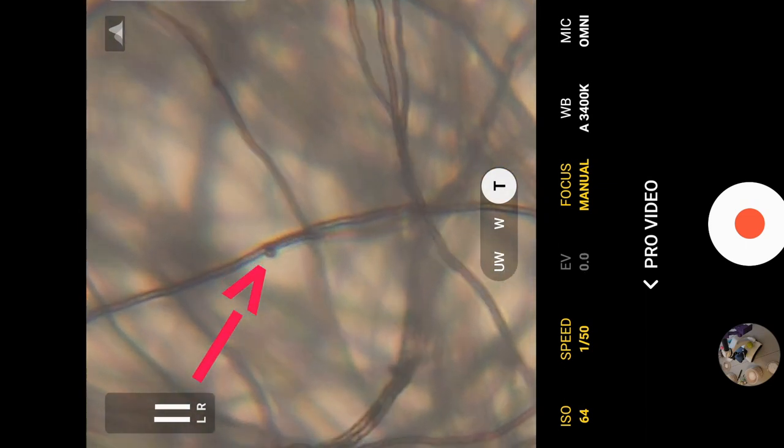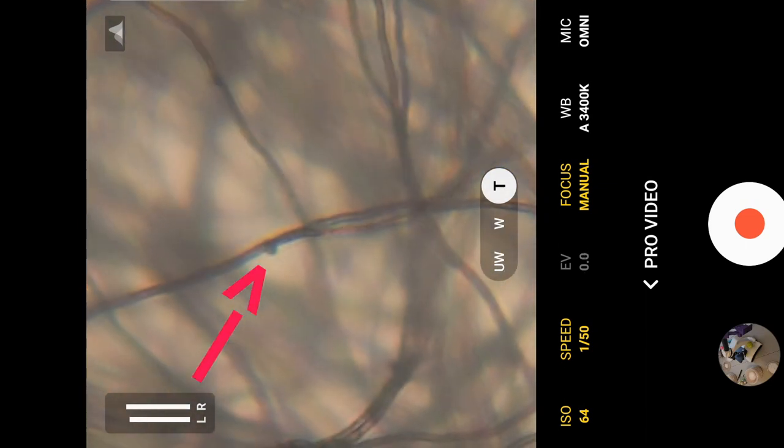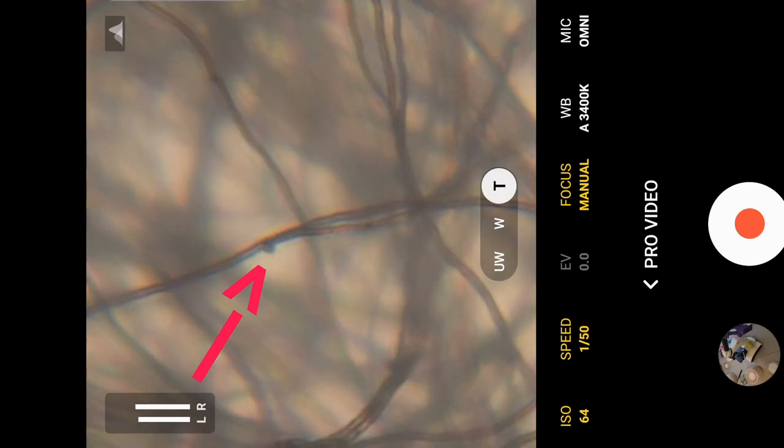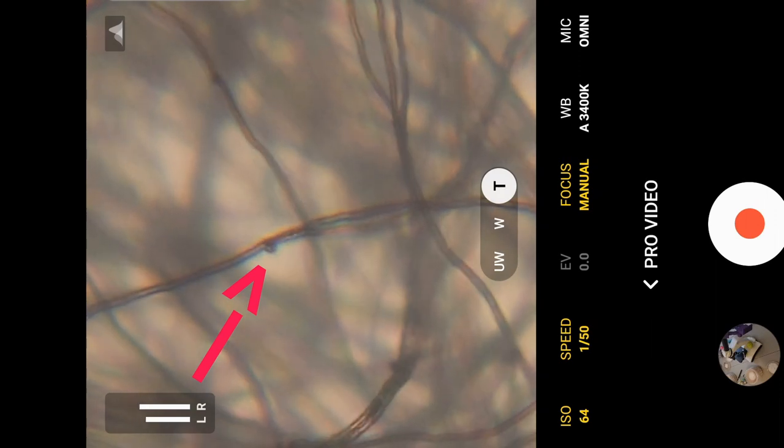Oh, there's one right there. You see, in these dikaryons, you can normally find them pretty quickly. I'll go ahead and I'll circle this in my recording.